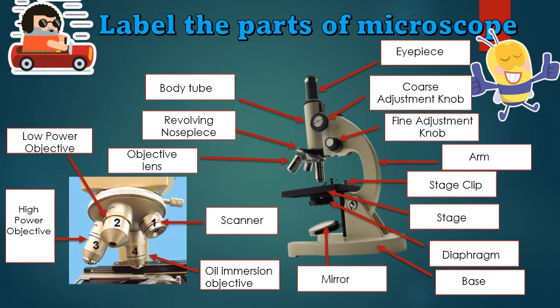Okay, now that you already know the different parts and functions of the microscope, I think you are ready to learn how to use this one in our activity.